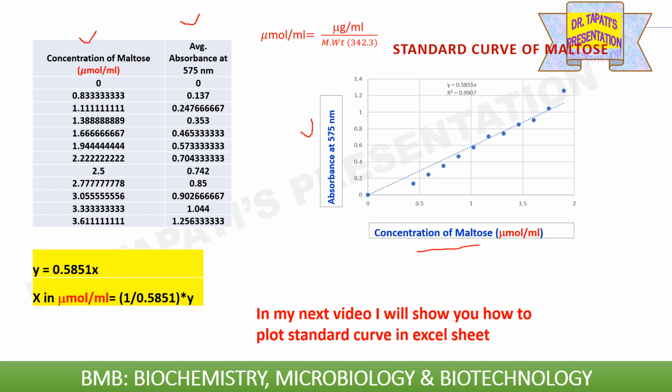And if we want to calculate the alpha amylase activity, we have to follow the exact same DNS method, and from this standard curve of maltose we can measure alpha amylase activity.